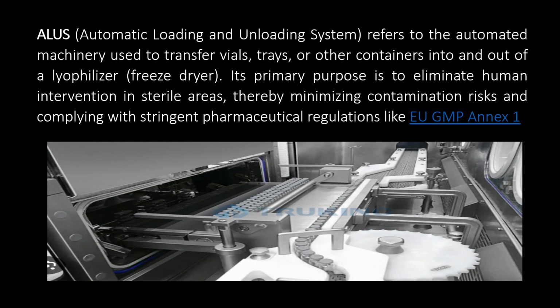So basically, ALUS, the automatic loading and unloading system, refers to the automated machinery used to transfer vials, trays, or other containers into and out of a lyophilizer, that is, a freeze dryer. Its primary purpose is to eliminate human intervention in sterile or aseptic areas, thereby minimizing contamination risk and complying with stringent pharmaceutical regulations like EU GMP Annex 1.